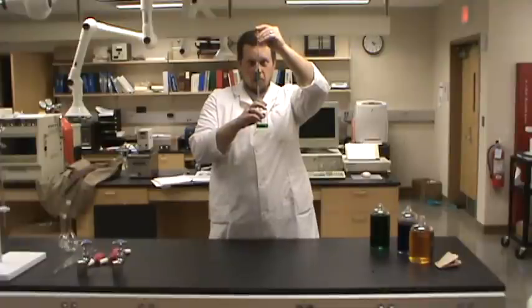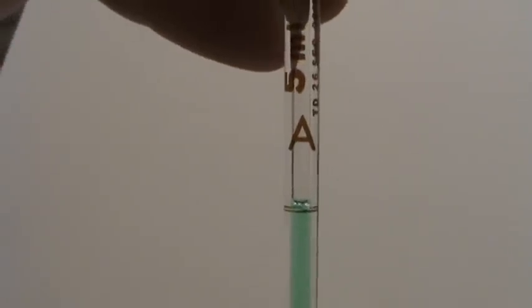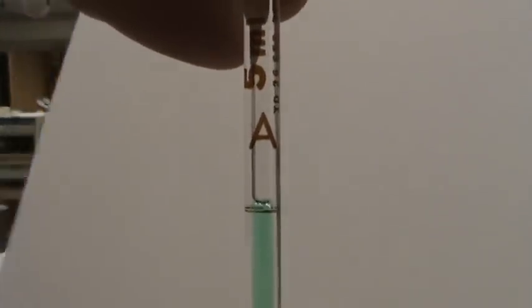And we want the bottom of the meniscus to be at the calibration line. So there's my calibration line. I want to get level with it and then let the liquid slowly drain down until the bottom of that meniscus is right at the calibration line.